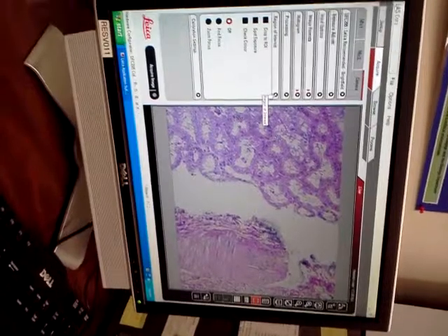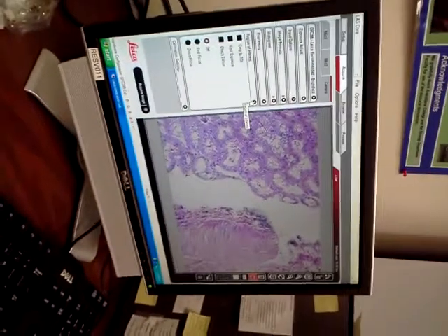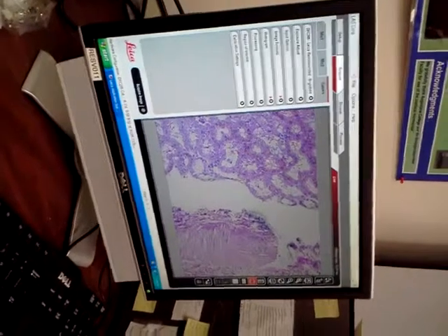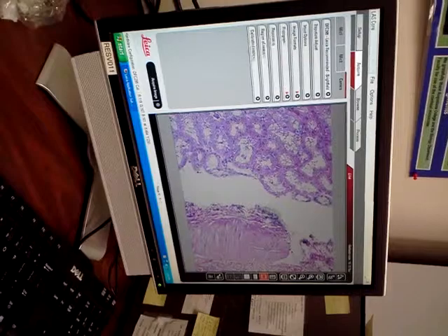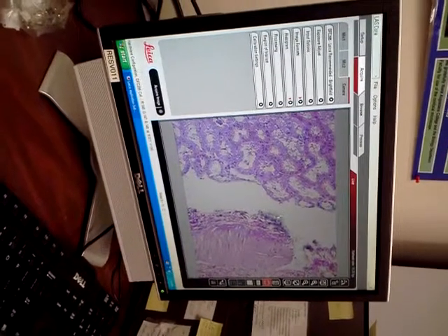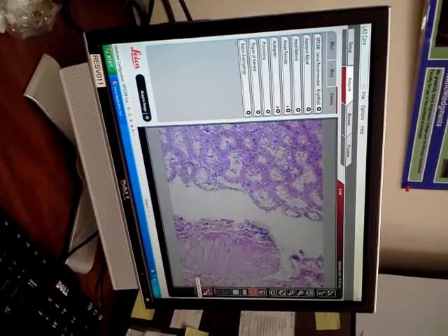You know what I would recommend doing if I were you and you wanted to do this? When you zoom in on a region of interest, you're not really gaining any resolution. It's just digital zoom. I'd recommend using what's called Dual Viewer, down here at the bottom.